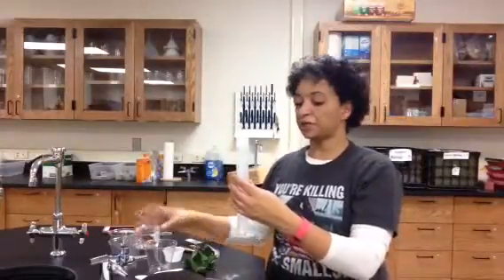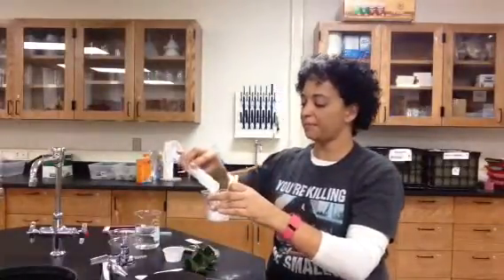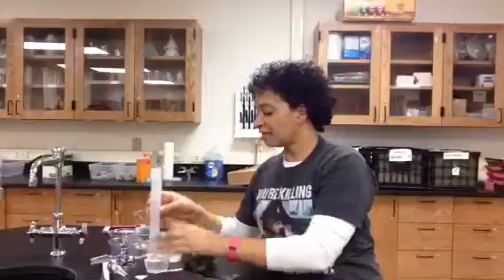Seriously, I tell you, my graduated cylinder skills are on fleek. I'm going to pour it into my first cup. I'm going to repeat that for my other 2 cups, and that'll be all of my solution.